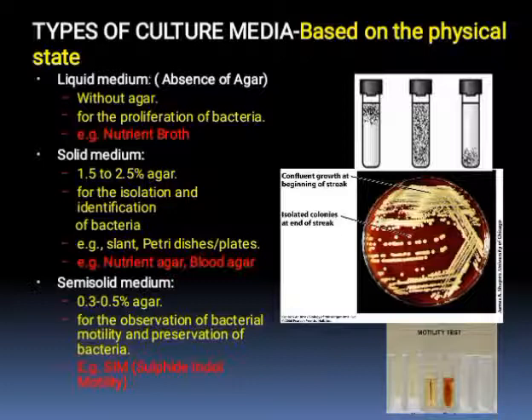Culture media on the basis of physical state. Number 1. Liquid medium. In liquid medium there is absence of agar, or you can say a medium without agar. It is used for the proliferation of bacteria. For example, nutrient broth.